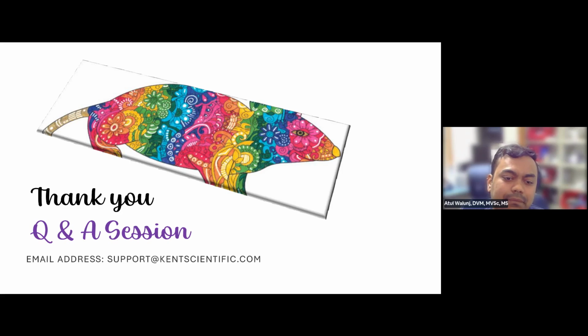Okay. So this next question kind of touches on that. Does the far infrared pad need to be in contact with the animals, not the housing cage or anesthetic chamber placed on top of the pad? I'm sorry, I did not get that question. I think they're asking whether the animal should be on top of the pad and not the cage or the chambers being placed on the pad.